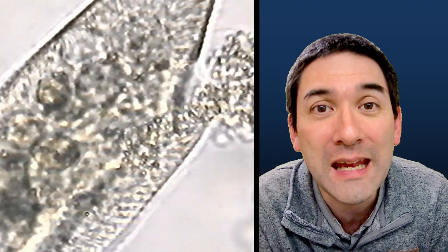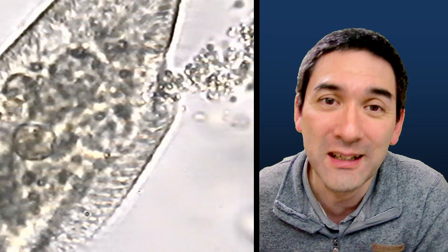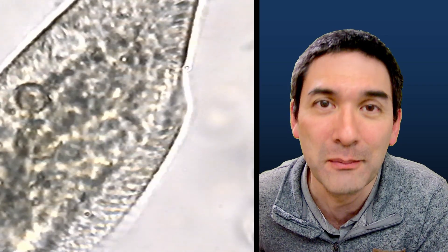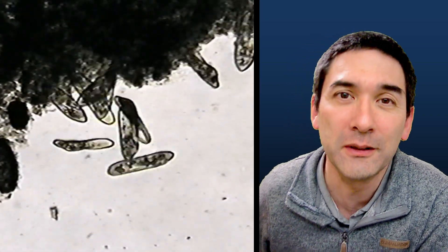There is a little so-called anal pore, also known as a cytoproct, where the paramecium is releasing undigested material. So yeah, as a matter of fact, it's pooping.